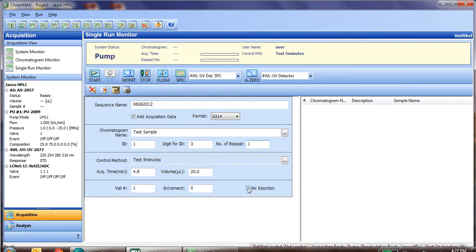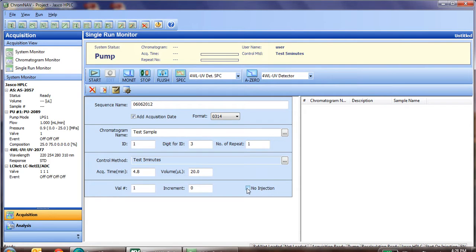If you just want to run the method and do not want to have the auto sampler do an injection, just simply check the box for no injection. And it will immediately start the method once you click the start button above. Again, we're going to inject from vial position number one, so we'll leave that unchecked.